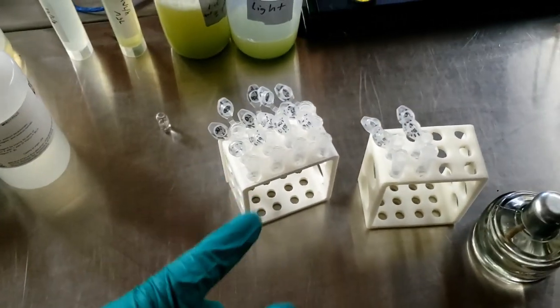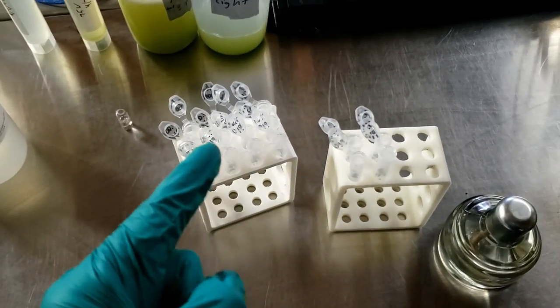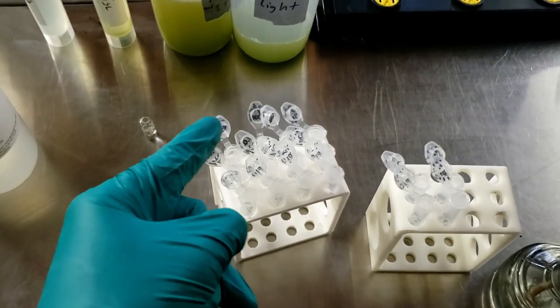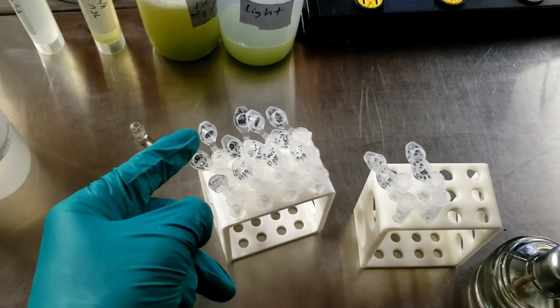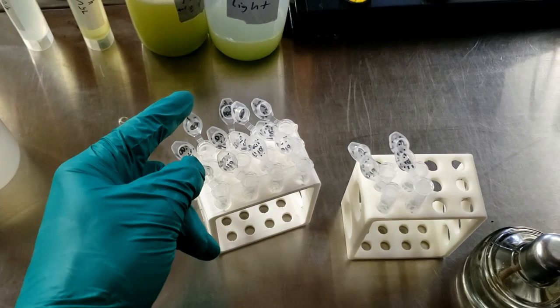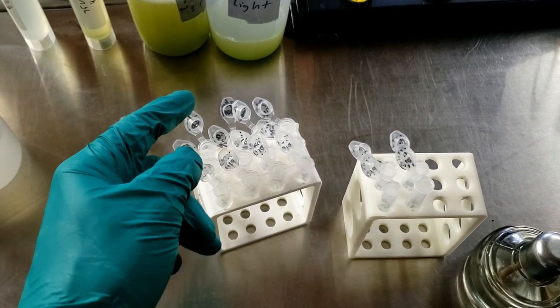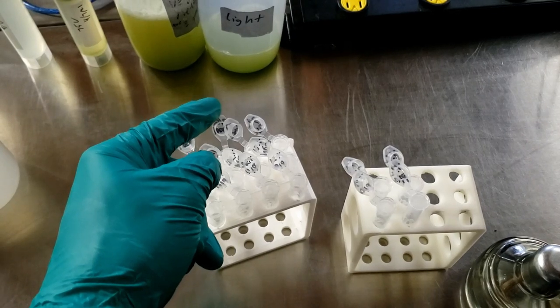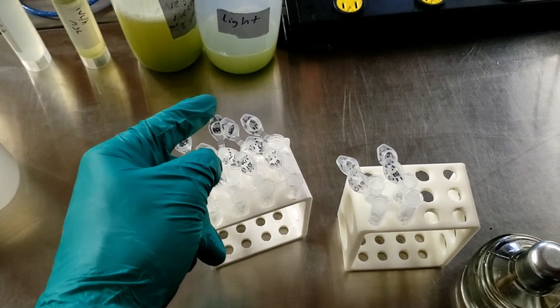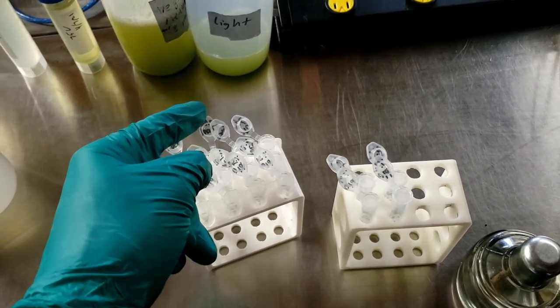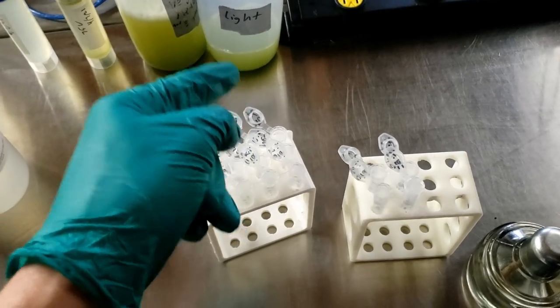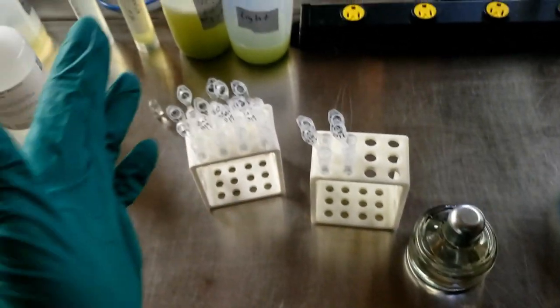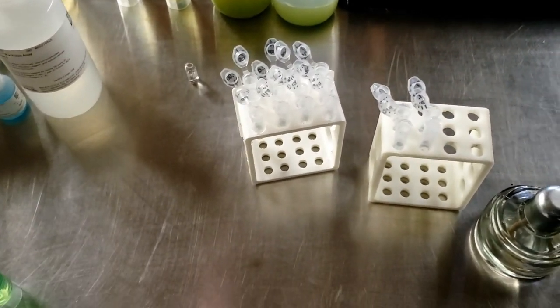You only need 100 microliters of each sample. So the way that I do this is I'll put 200 microliters of BSA into the full strength tube. And then I'll take 100 microliters of that, put it in the next dilution with 100 microliters of water. Then I'll mix that together, take 100 microliters of that, put it in the next dilution with 100 microliters of water, so on and so forth until I'm done with the dilutions.